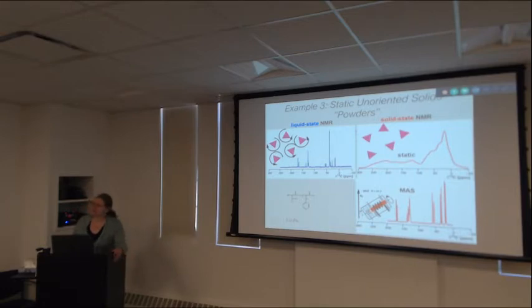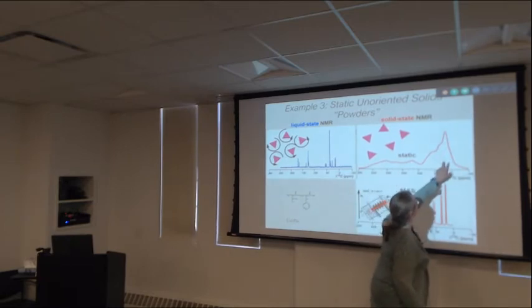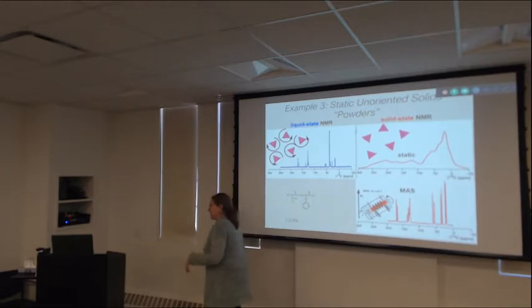So in the end, you can think about some of the advanced experiments. We're looking to get that information with that resolution. Oftentimes, that's what we're trying to do. We want to know that this one was broader, this one was narrower. But in the end, we want to detect super narrow lines like that. So how could you do that?